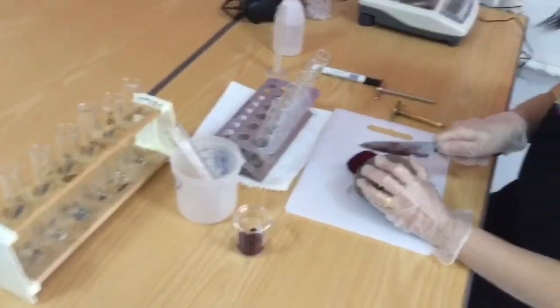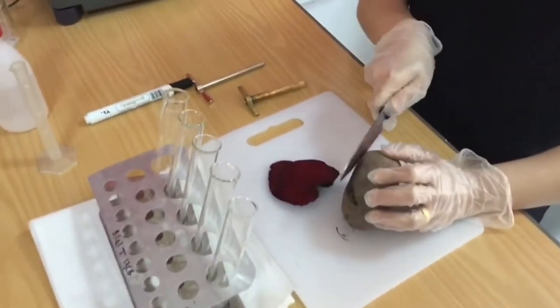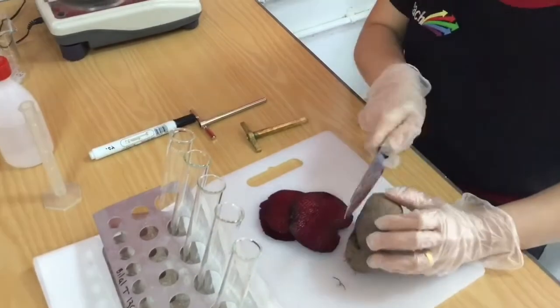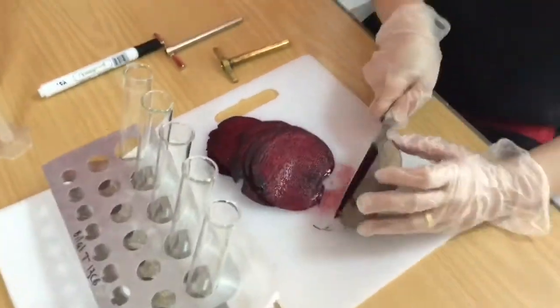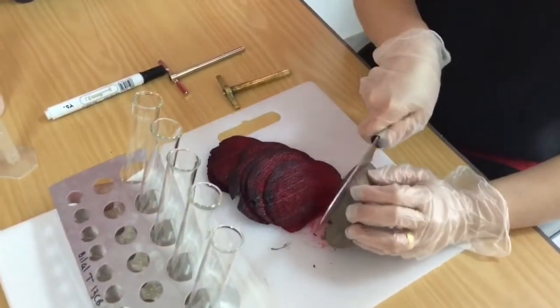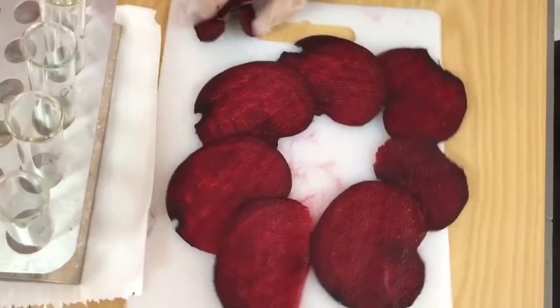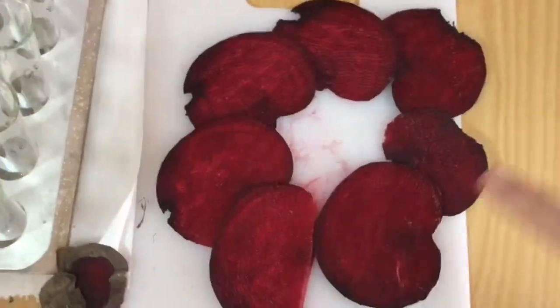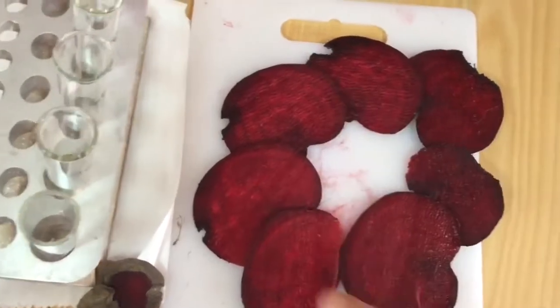Start by cutting 2mm deep discs of beetroot. This is a good way for us to see the variability in color across each of the discs, which is of course going to give us variability in our results depending on where we take our discs of beetroot from.